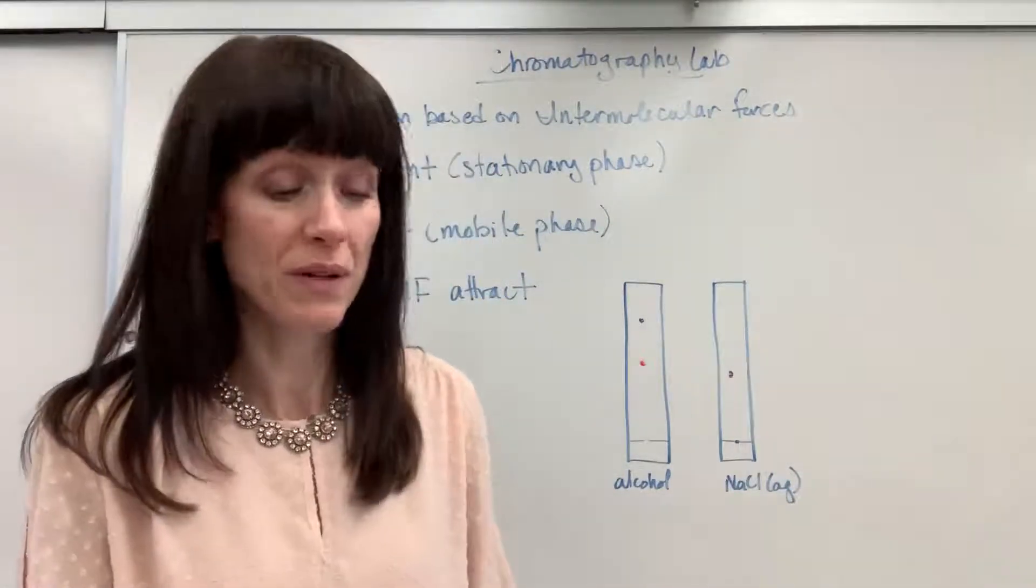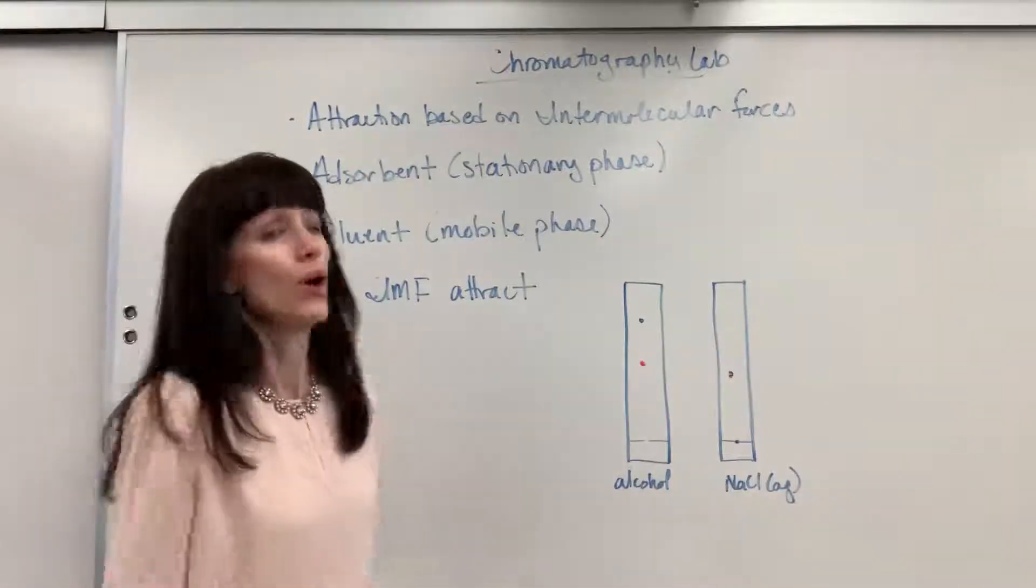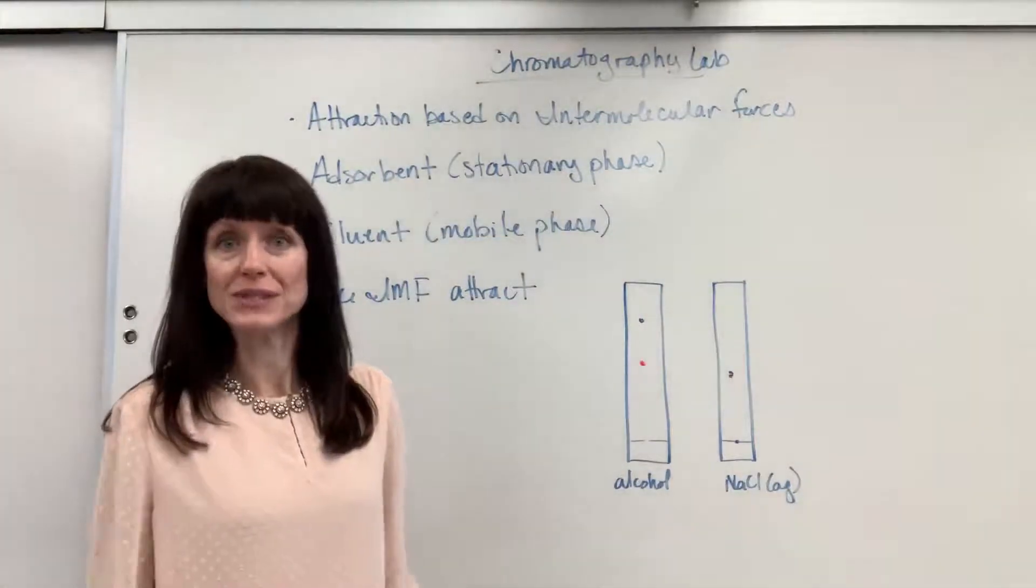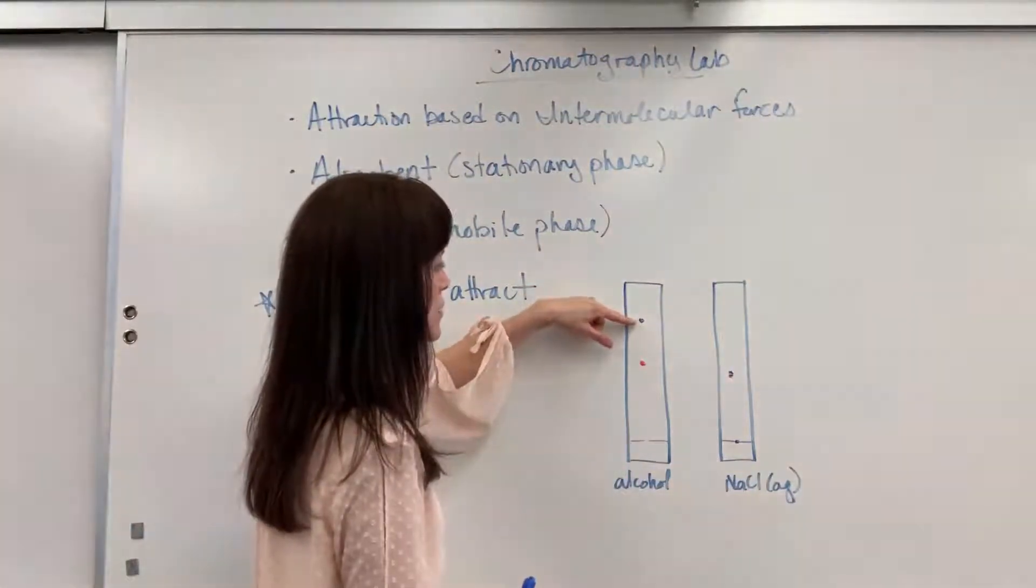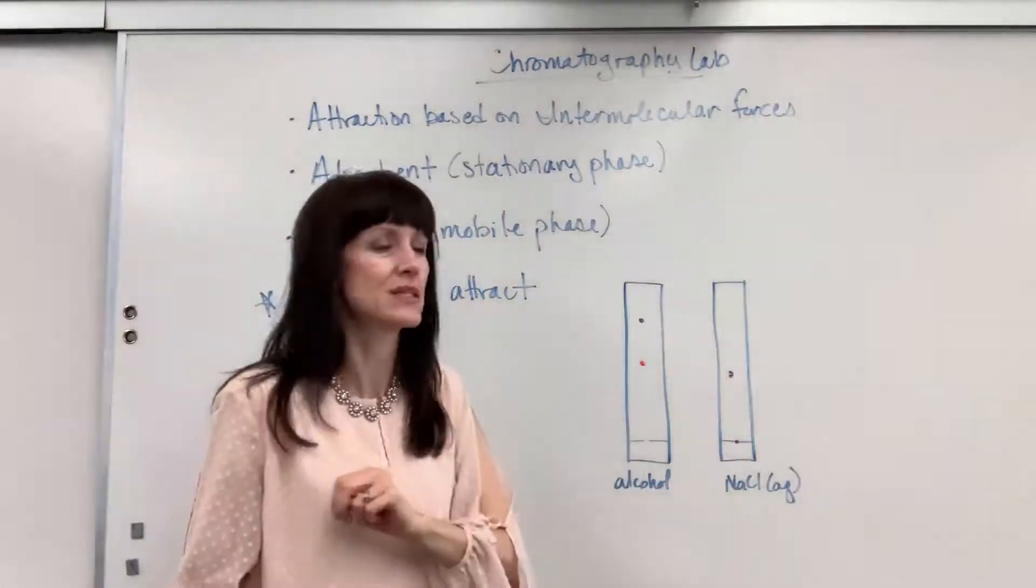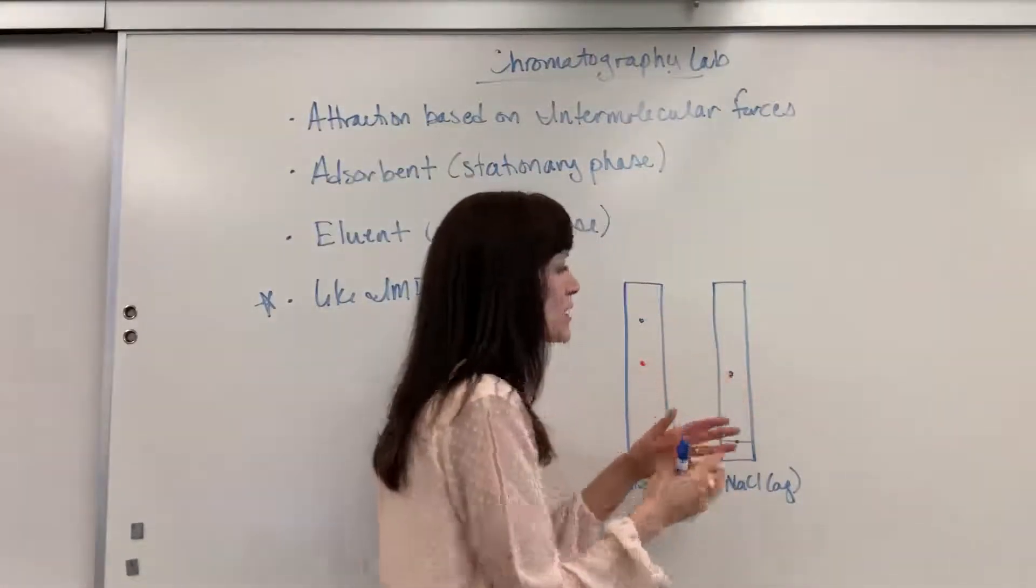And my task is to identify which one separates better. We can actually get quite a bit of information out of this. Number one, it's easy to see which solvent is going to separate the best. It's the alcohol. I have a very distinct separation between the blue and the red. I can see both of those dyes. Here, I'm starting to see the red and the blue separate. It's still kind of a blend.